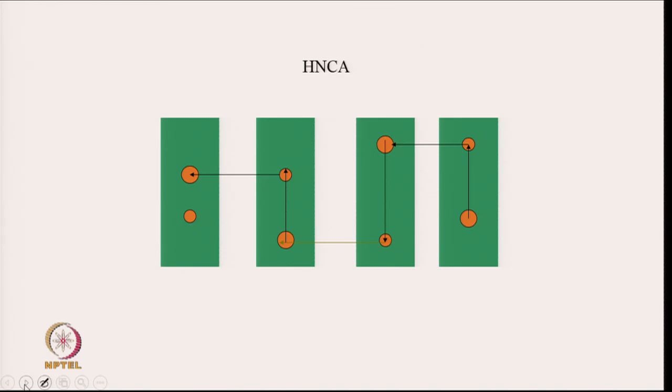Now, the way you do it is you take all the different planes which differ in 15N chemical shift, and try to look at which plane coincides with the plane where C alpha of the preceding residue is correlated with C alpha of the ith residue.